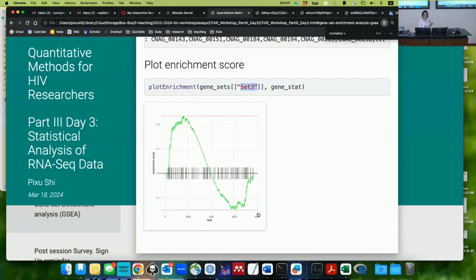So there's also this gene set enrichment analysis software. It's pretty popular. I know where you import whatever file that way. And now other people will use the fgsea package in R. Do you have any opinions on that? Do you know what software I'm talking about? Which one? What is it called?